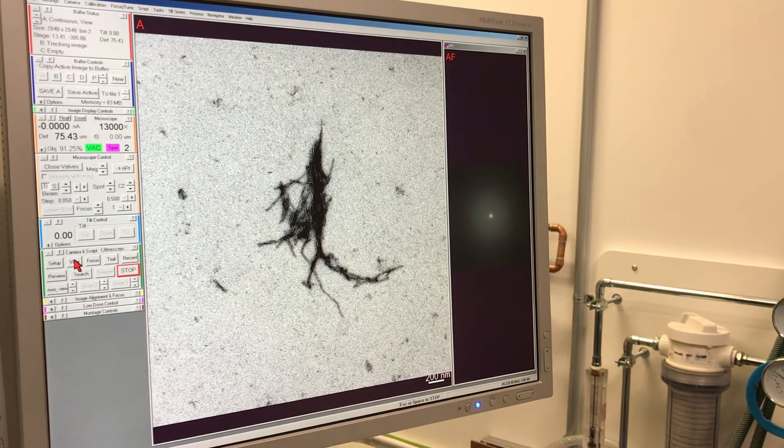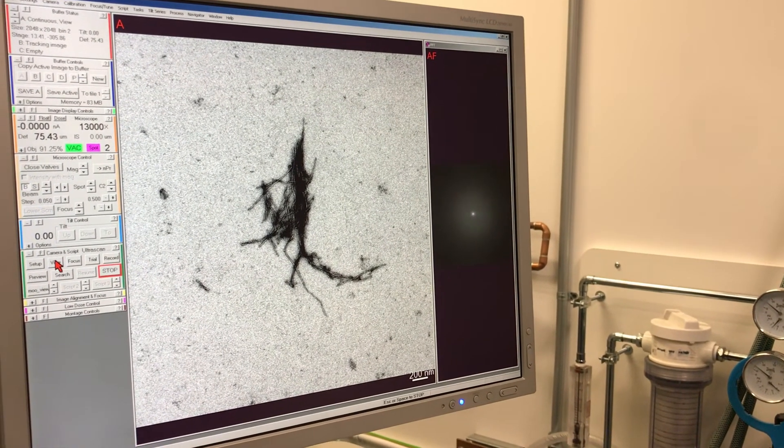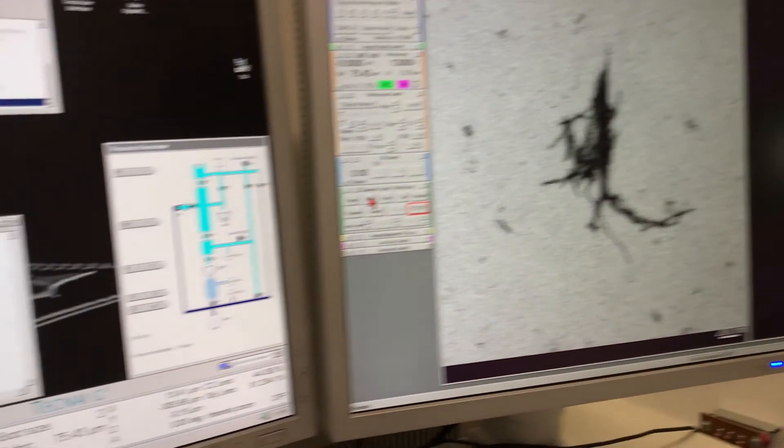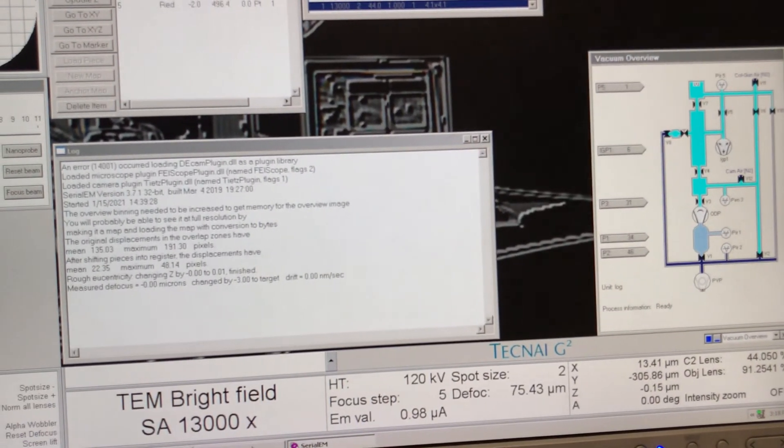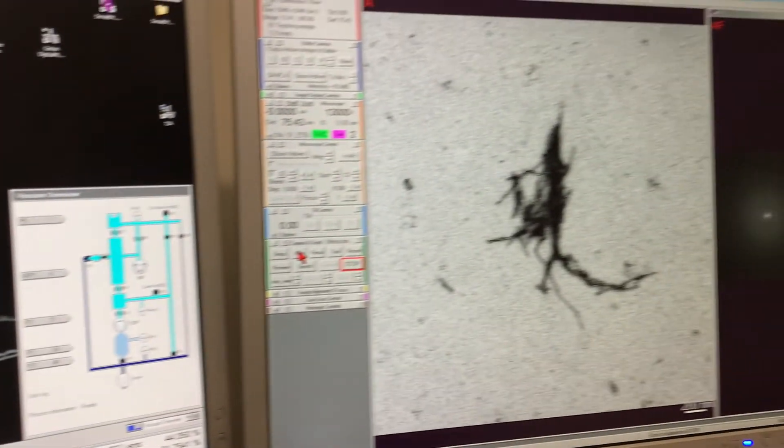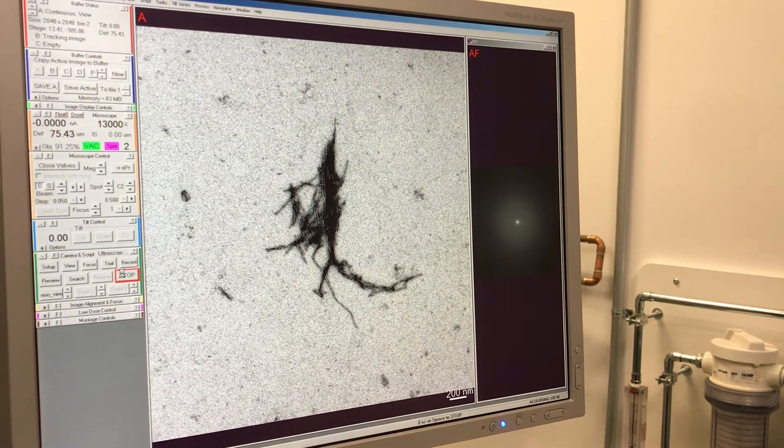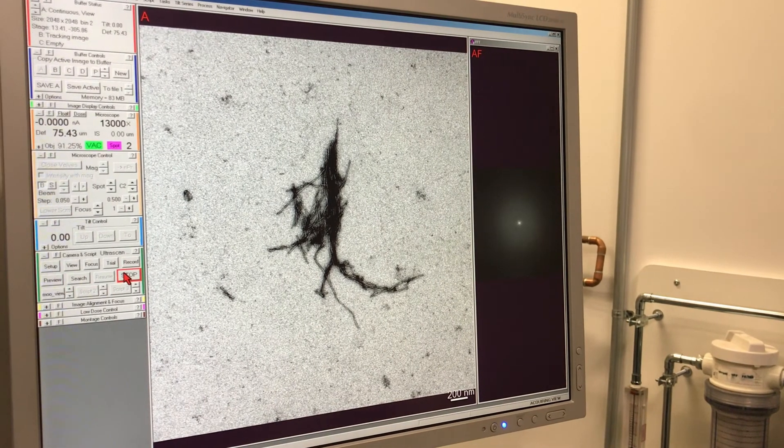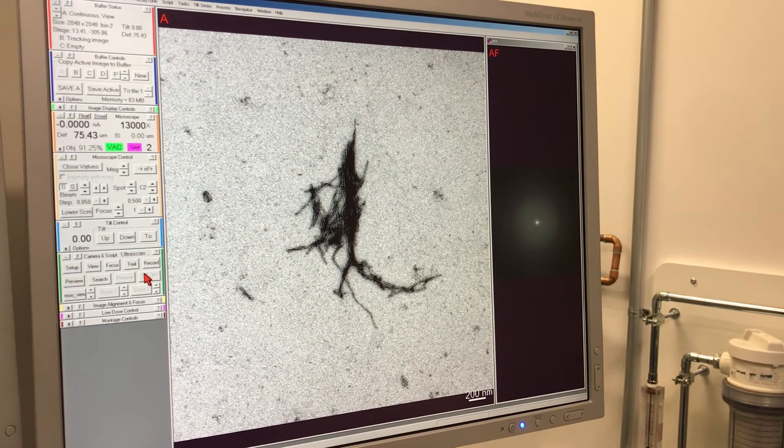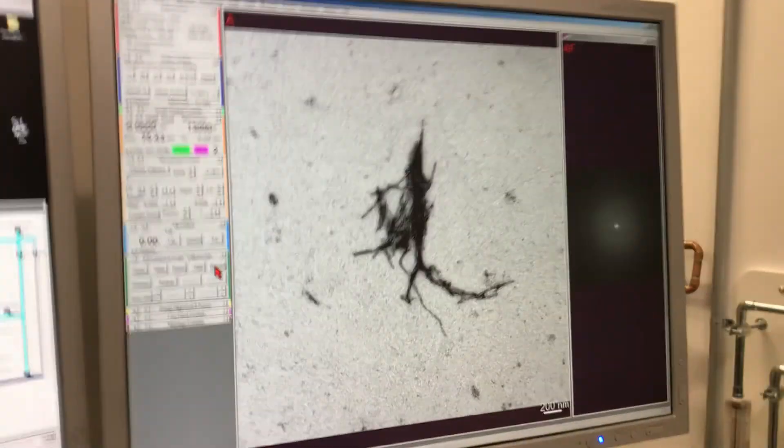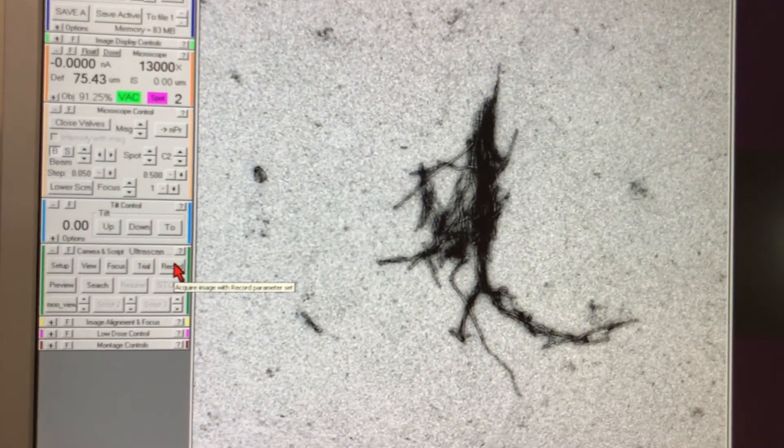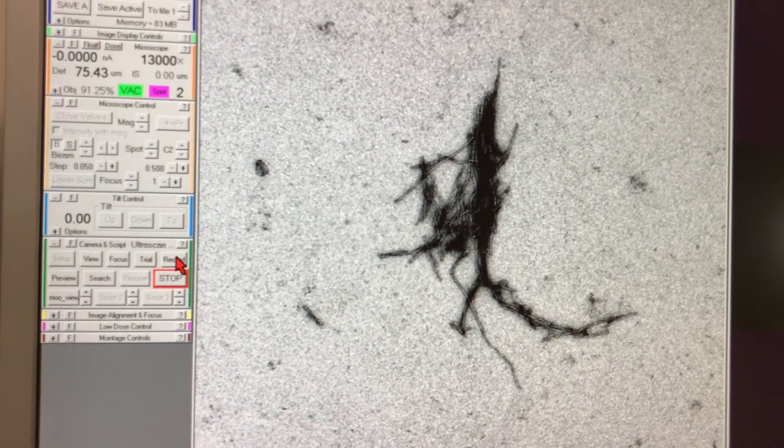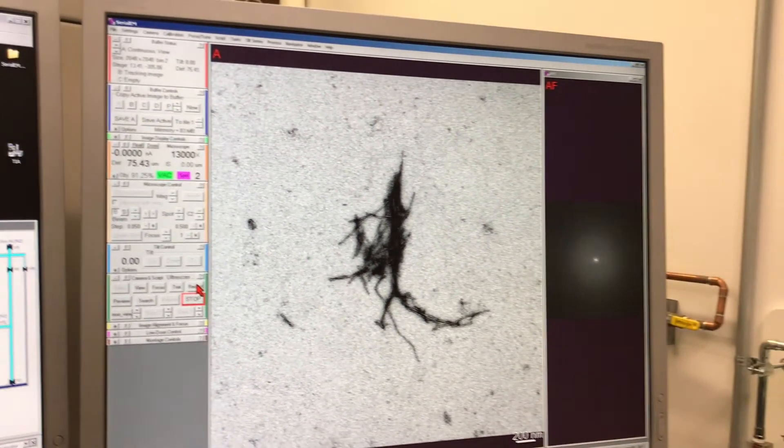You can also refer to the small window on the right-hand side—those are basically Thon rings that you don't see clearly right now because the image is not in focus. But as you keep on changing the focus, there will be concentric rings that will appear into that area. As soon as you get an image with good information, you can also correlate it with the Thon rings. The more Thon rings you see, the better image you can have.